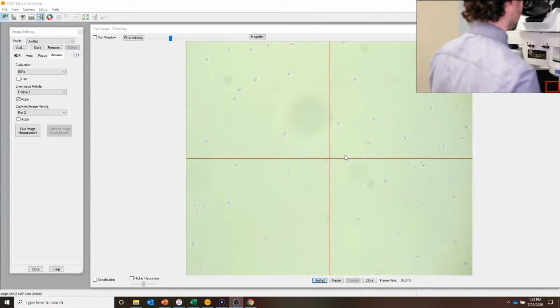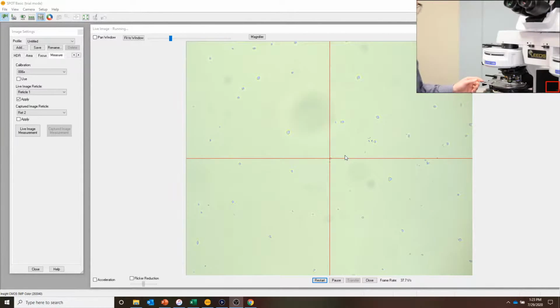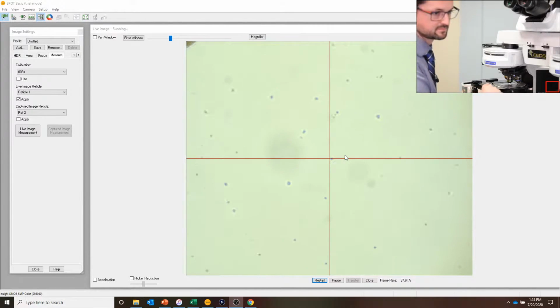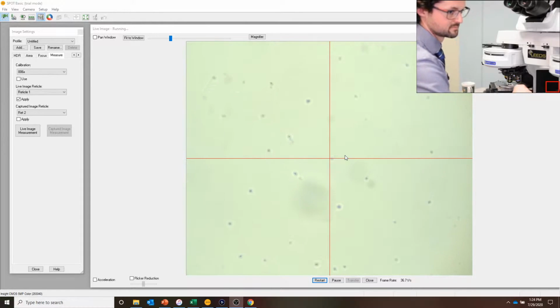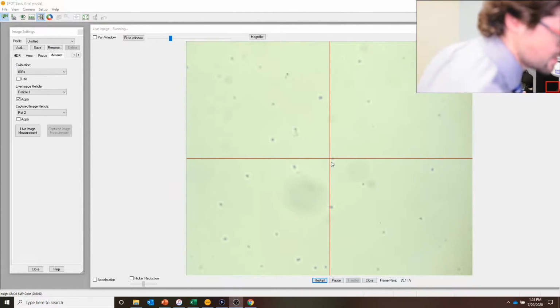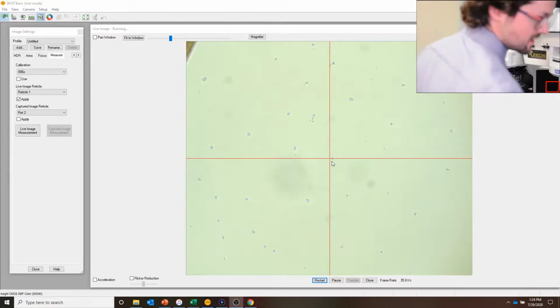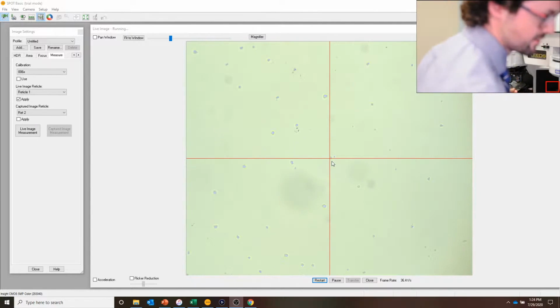We're going to do one more quick alignment. Going to do a slide adjustment on there. That's good enough. And then we're going to watch the rotation. And this is where you can be as critical as you'd like. You can kind of see, you see how it's going slightly out of focus. That's because this stage has some weight cantilevered out.